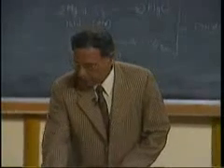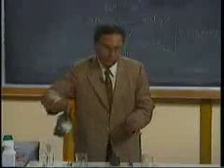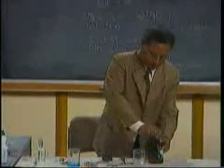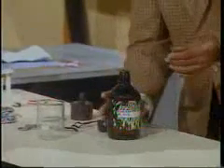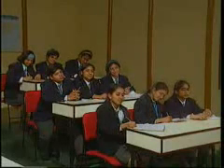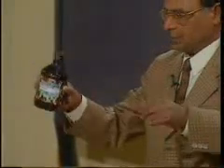I take again the magnesium ribbon only, take it in the test tube and then add to this hydrochloric acid. You see the solid metal in the form of flakes in the test tube, and this one is a liquid acid, hydrochloric acid.